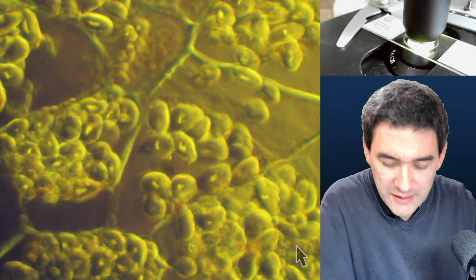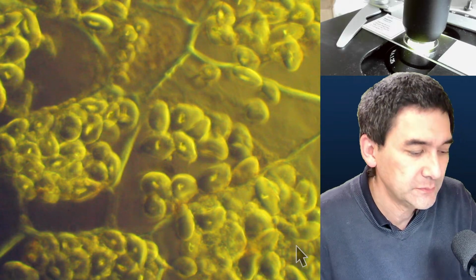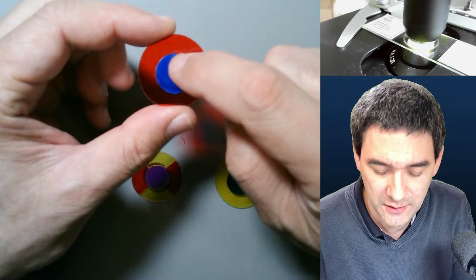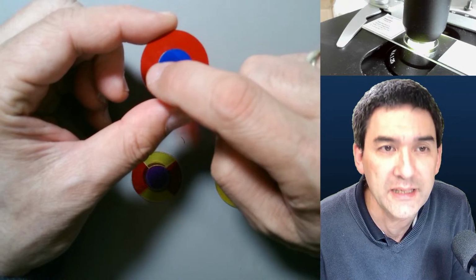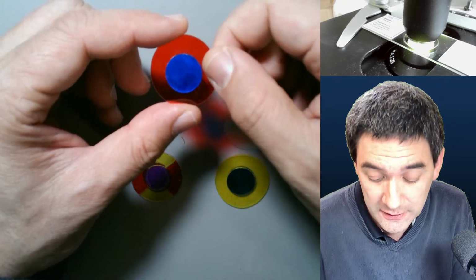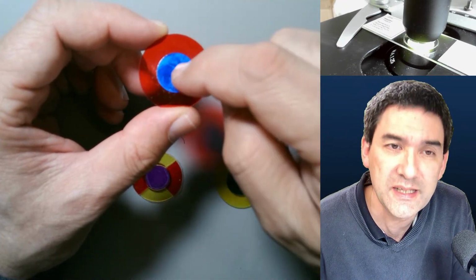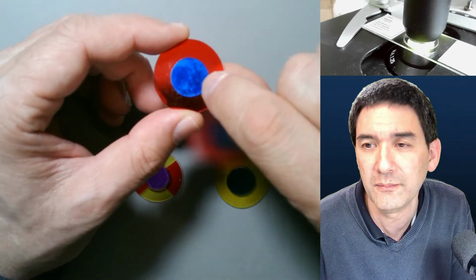So the question is whether it's worth trying out: if you separate the red outer ring and the central disc more by adding a black ring, would this increase the contrast? Something I didn't try out yet, but that I could try. Maybe there is less color mixing between the inner and the outer one. Yeah, this could be.